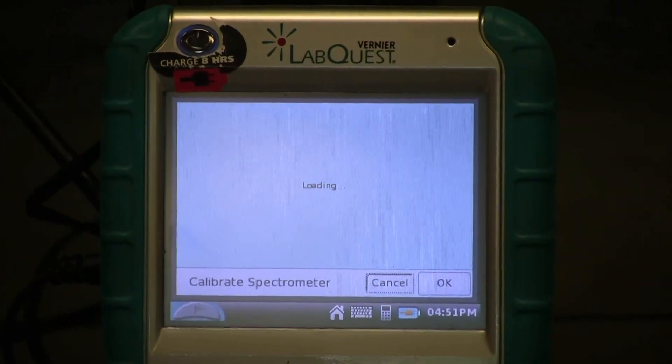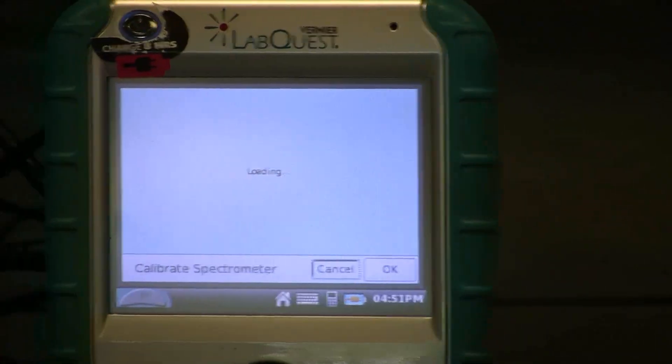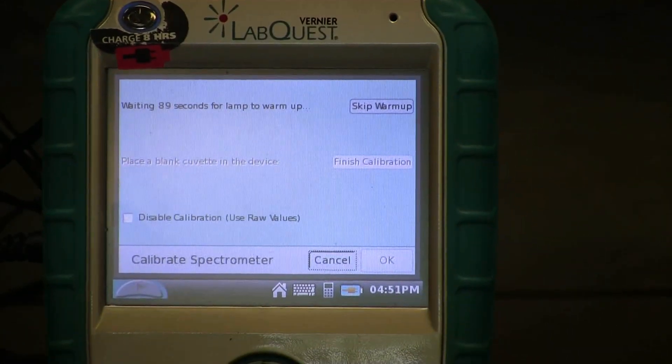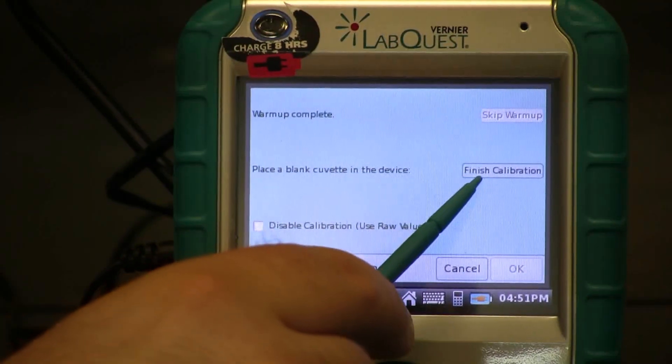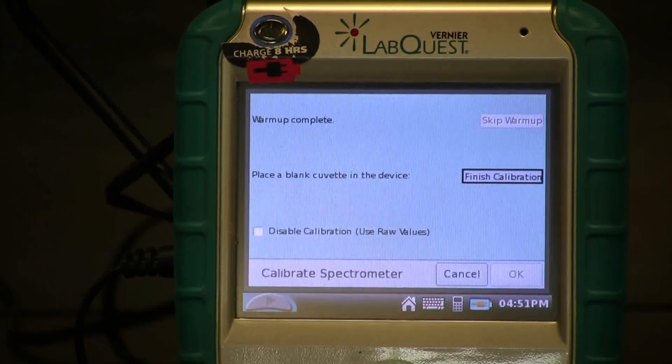You will have to wait 90 seconds before you can start calibrating. Once you've waited, click Finish Calibration.